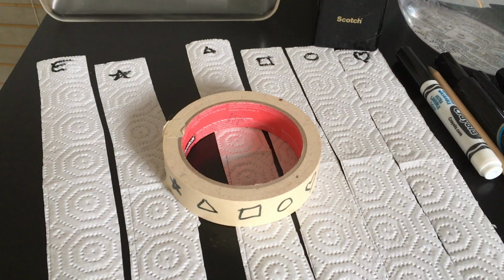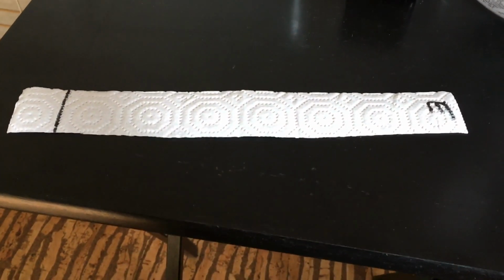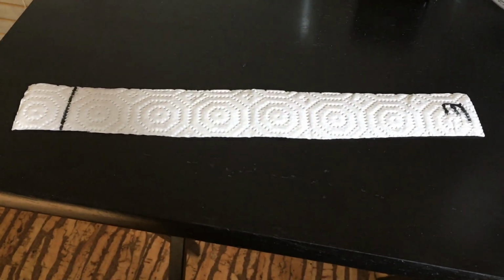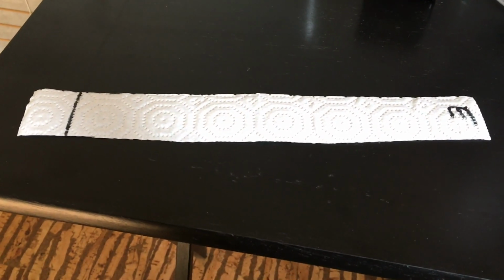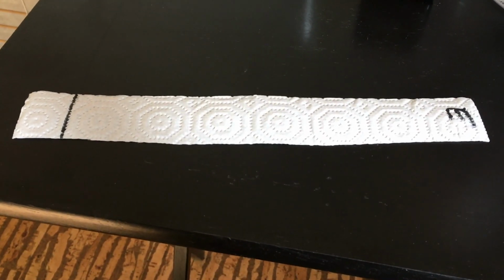Now we've got one extra strip, which is our evidence. And here's our evidence strip. We don't have a pen to go with this. This is what we're trying to figure out, the pen that was used to make that line. Obviously, if we were using real evidence, we wouldn't have it on a paper towel like this, but we could test a sample of the ink from the paper.